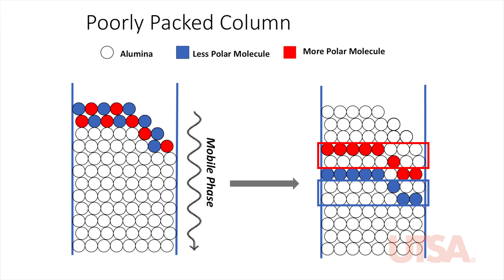This snapshot of the column shows how an impure fraction is developing. There is a mixture of fluorene and 9-fluorenone. The shift in the alumina caused this, so make sure your alumina and sand are level.